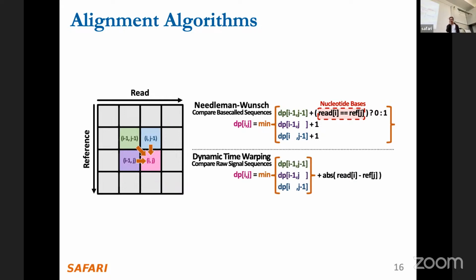Right. And this is the point where, as I mentioned, we can get inspired by base code aligners or base code mappers. We can do very similar things for raw signals. Whether they're represented as integers or floating points doesn't matter too much. The point is it's numeric values of a relatively large range. We're working here not with quantized values, by the way. We only quantize the values for the sake of seeding and chaining. Here we go back to using the raw original values because we want to analyze it at as fine a granularity as possible.